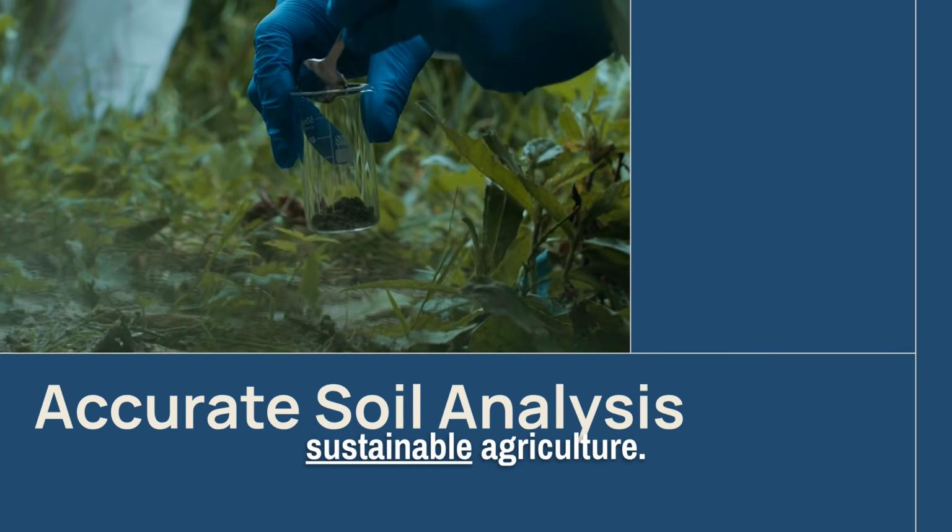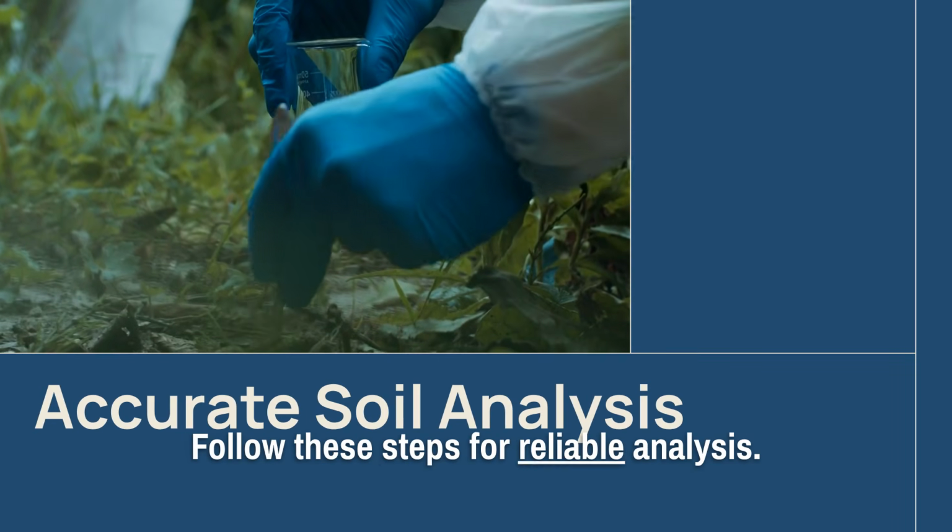effective soil management and sustainable agriculture. Follow these steps for reliable analysis.